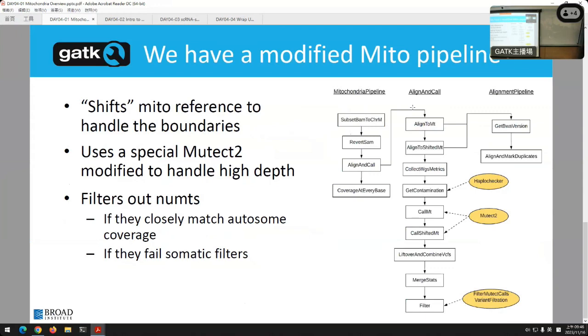But also, as I mentioned, the depth can get crazy on mitochondrial DNA. It's one thing to look at 30x coverage in a genome. It's another to have, I don't know, 25,000 depth. And weird things happen when you have that many reads. Like, when you think about 1 error per 1,000 bases, just in sequencing, how does that add up when you have 25,000 separate reads?